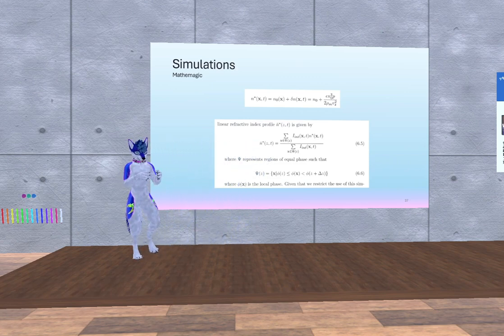But essentially, you imagine we have this refractive index profile, and now I need to run an optical simulation on this to figure out what my complex reflectivity spectrum is going to be coming back off this thing, so I can simulate an OCT. That's really difficult, and you have to run a lot of wavelengths through for a good simulation. You imagine you have to run some 2,000 or so wavelengths through this in order to get a good OCT simulation. I'm not going to do 2,000 optical wave simulations per interrogation point.